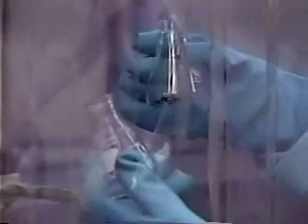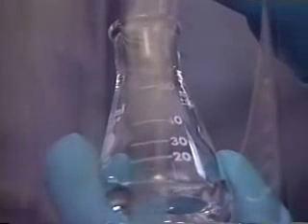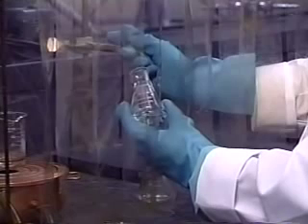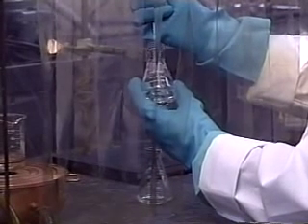You may want to wash the pellets with a small amount of fresh solvent. To transfer the solution using a Pasteur pipette, place the tip of the pipette against the bottom of the flask. Draw liquid into the pipette, leaving the norite pellets behind. Again, you may wish to wash the pellets with fresh solvent.